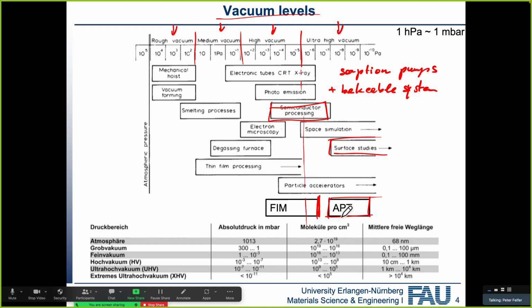Yep. The increase in the temperature in the ultra-high vacuum is just because of the kind of pumps that we use in there? Or, if the pumps which are currently used for high vacuum are advanced, and in the future we can use them for ultra-high vacuum, then we will not have the increase in the temperature?